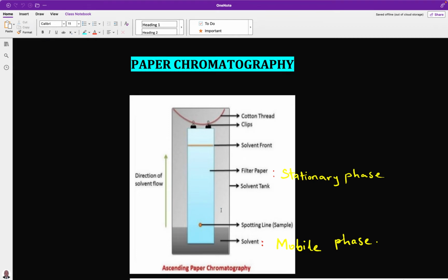There is also the lid and a clamp to cover the beaker, in a case where the solvent is volatile. Usually, the ultimate goal of this technique is to determine the purity of the substance by investigating if there are some impurities present in the mixture.